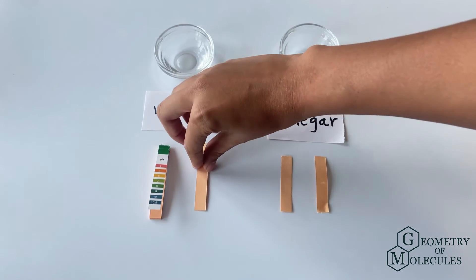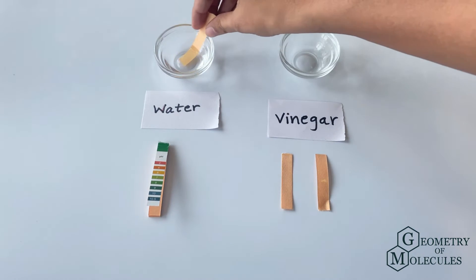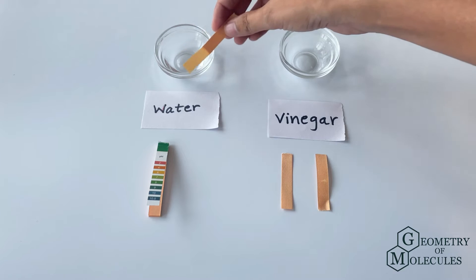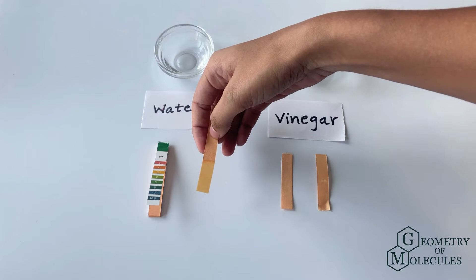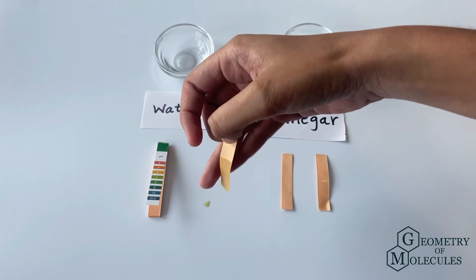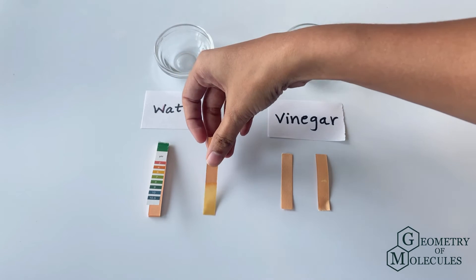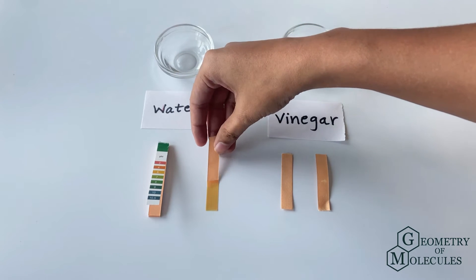Now let us test that by dipping our pH strip in water. We know that water is neutral, and as shown in this guide, the pH strip should change its color to light green. As you can see, the strip has instantly changed its color from orange to light green.